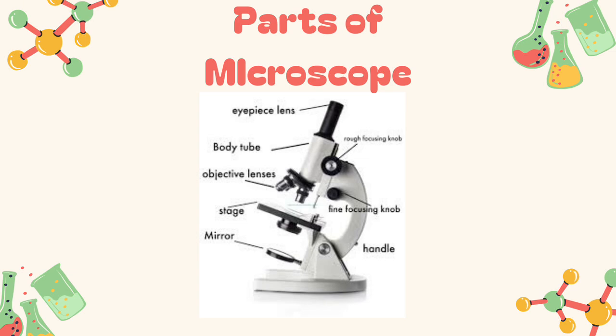So a microscope has several important parts, each with a specific function. First one is the eyepiece, where you look through to see the magnified image. Next one is the objective lens. Lenses of different magnification levels, usually 4 times, 10 times, 40 times, and 100 times. Stage, the flat platform where the specimen slide is placed.